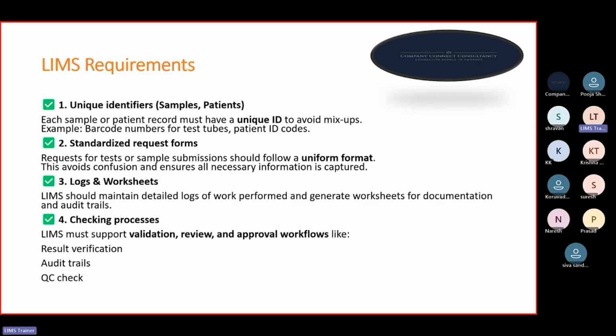As a LIMS consultant, you will be responsible to understand the requirements of the client, and what modules they would like to include. There will be different modules, which I will explain in this course: what standard modules there will be and what customized modules they want to include in the software.